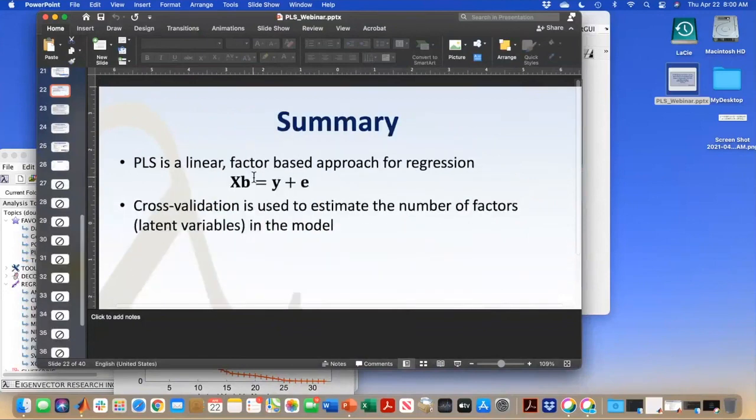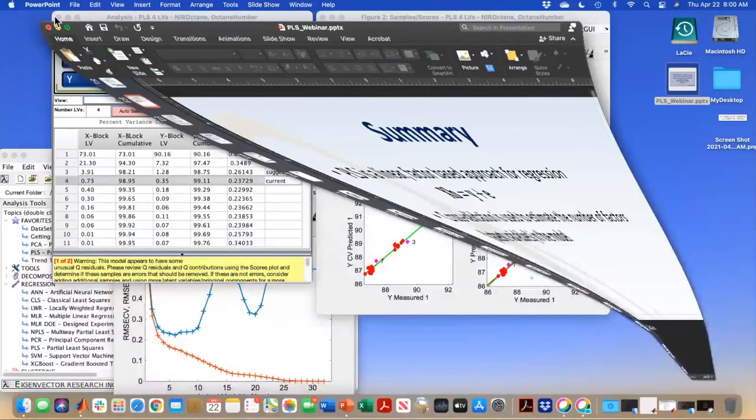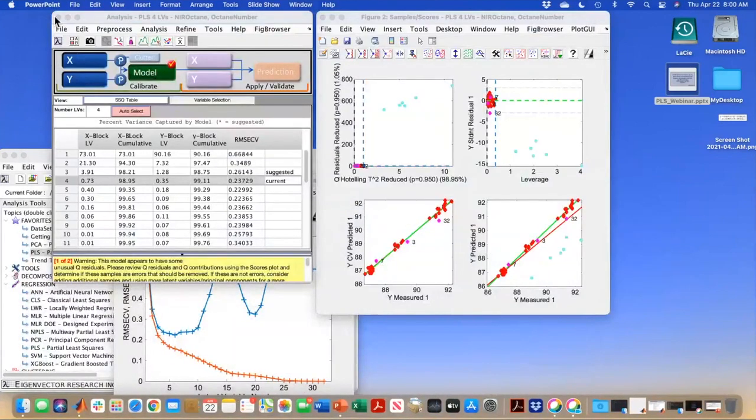It'd be sort of like adding an offset term in here if I mean center both of them. And it's usually recommended, and you can certainly test by not doing it. And I think you'll usually find that you get a much worse prediction, cross-validation or test prediction.